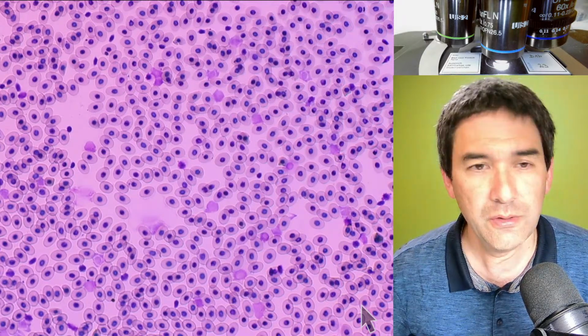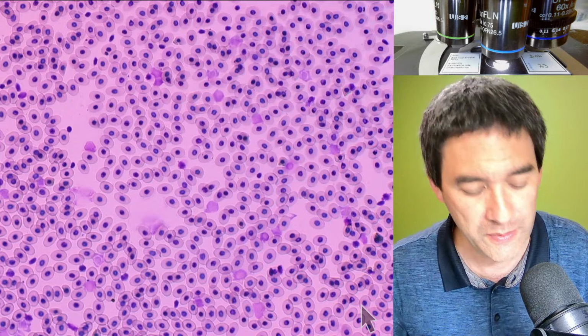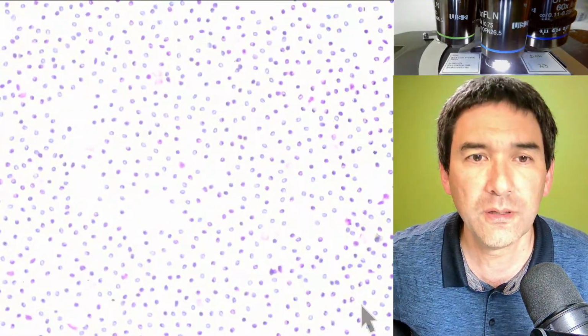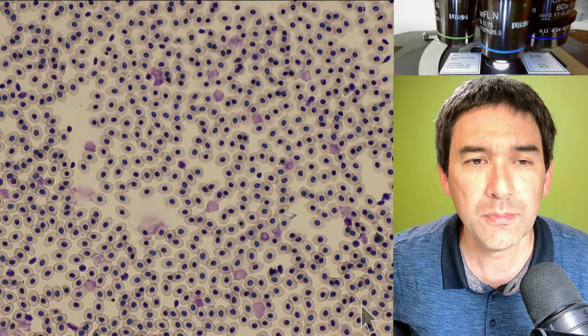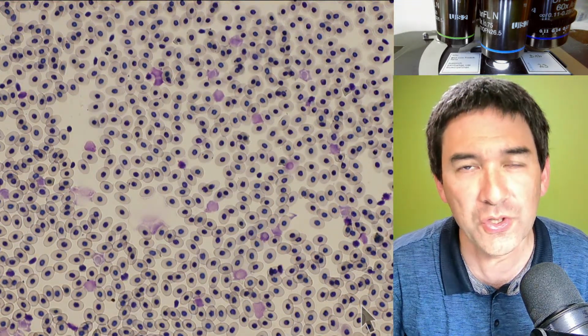You're going to see there is not so much of a huge difference in this case. So it depends really also on the specimen itself whether DIC microscopy is useful or not. But I can simply flip out the prism, and then I'm in bright field. And today most of the things I've been doing in bright field because I did some staining.